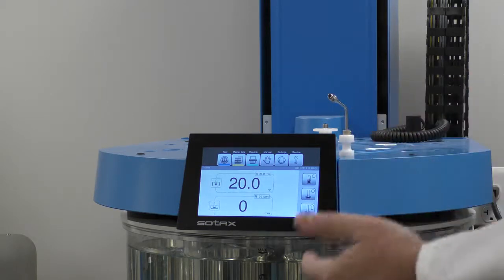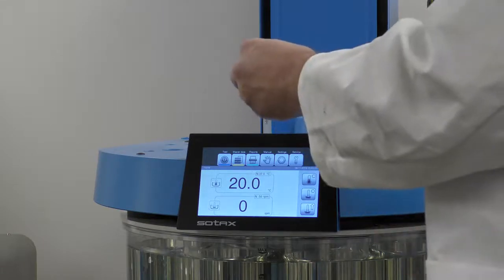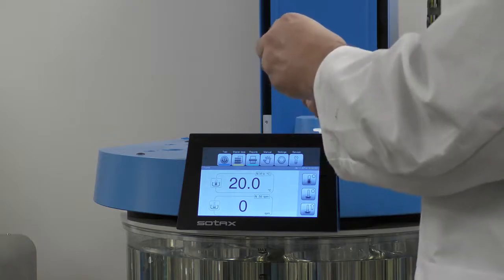Then we would run our test. After the test is complete, we simply screw on our syringe and take our sample.